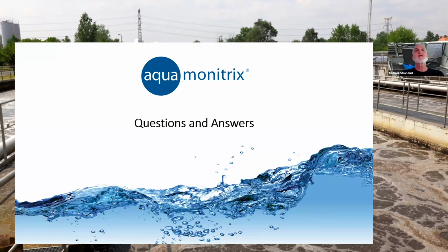And just to add to that, one of the strategic reasons we see that is, we are familiar that other ways of measuring ammonia have advantages and disadvantages, but certainly drift in wastewater applications can be an issue. And the other reason we're looking at this is with one eye on the Urban Wastewater Treatment Directive, adding stricter total N requirements for final effluent.